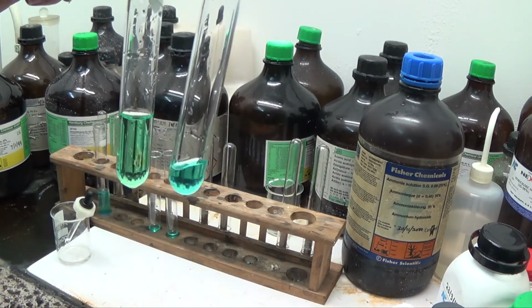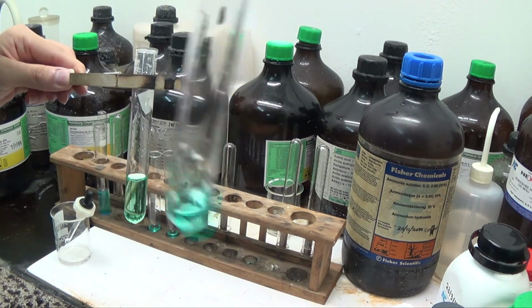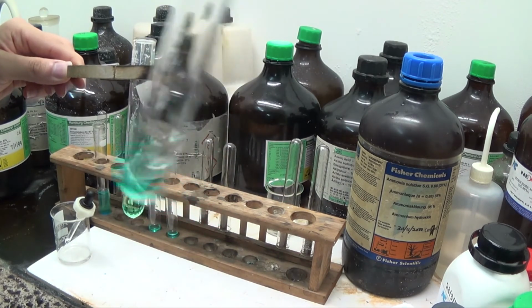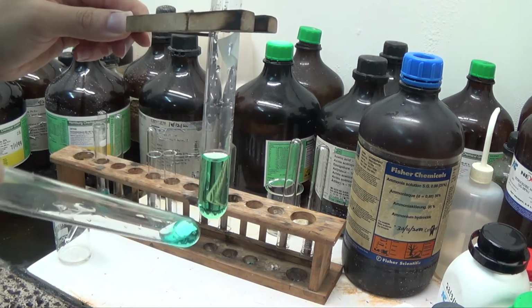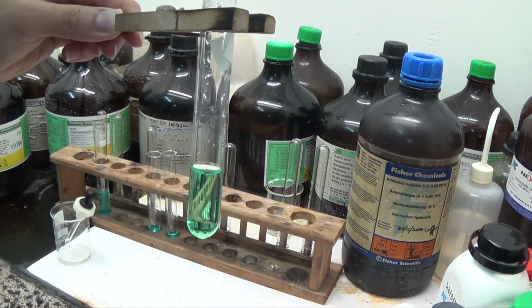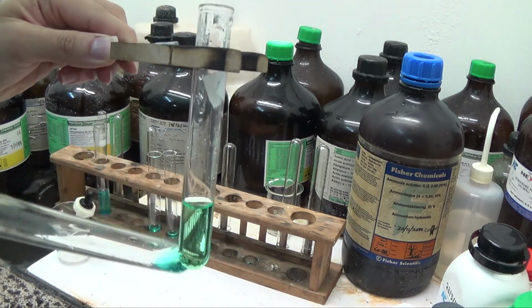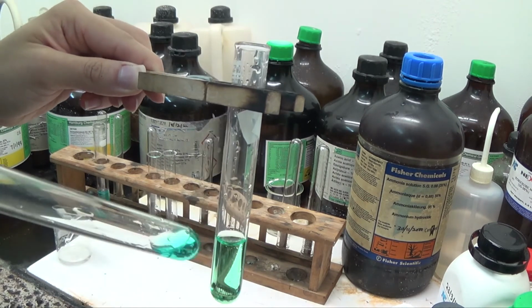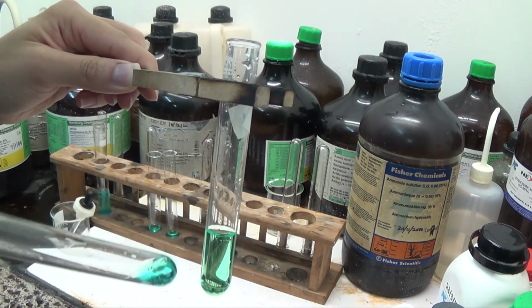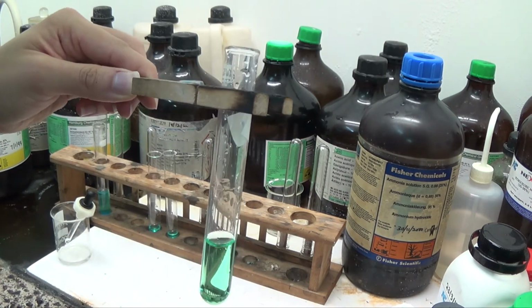The blue solution is just copper 2+ with water around it. So this is the aqua complex with 6 H2O around the Cu2+. The Cl- has replaced the H2O molecules. There's a change of geometry. Now this is CuCl4 2- because it's still Cu2+, but it's got 4 Cl- in a tetrahedral geometry.